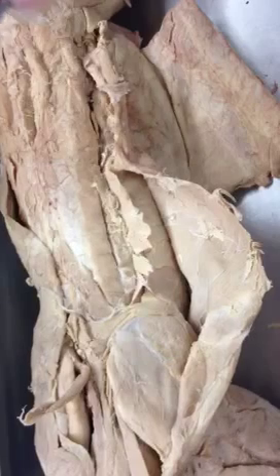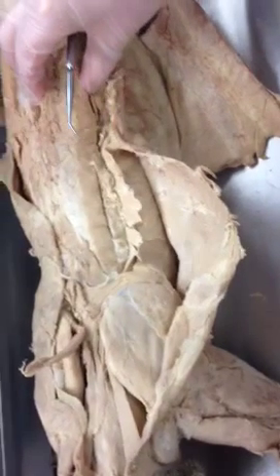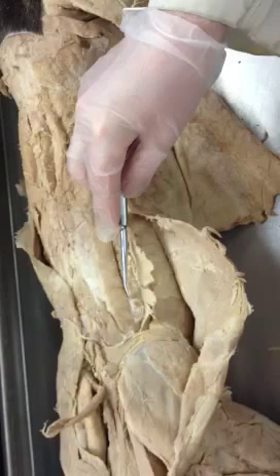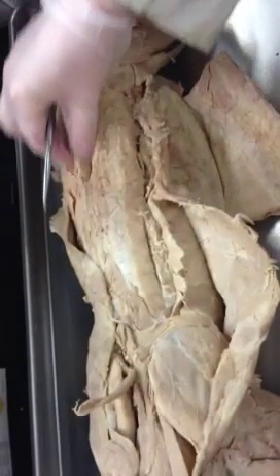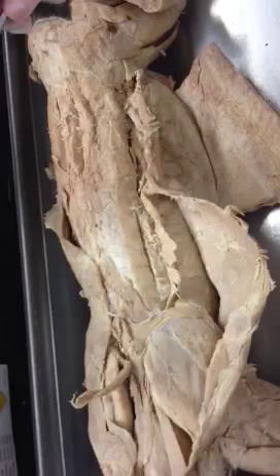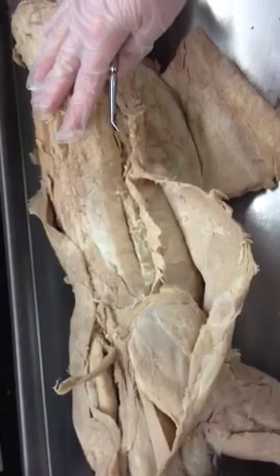So if you remember, we use the mnemonic SLIM: S for spinalis dorsi, representing the spinalis group; L for longissimus dorsi, the middle column; I for iliocostalis, the column furthest from the spine; and M for multifidus spinae, right on the spine. SLIM — remember that. And those are the deep muscles of the back.